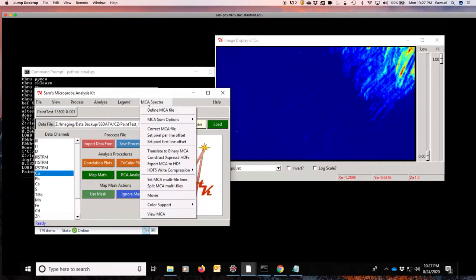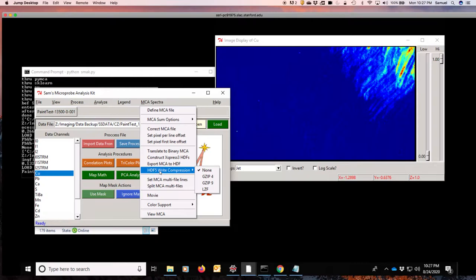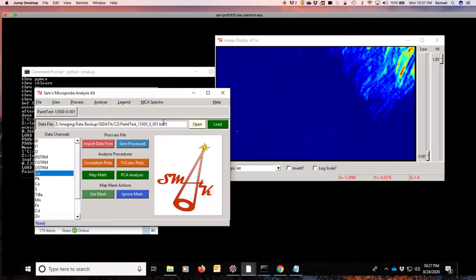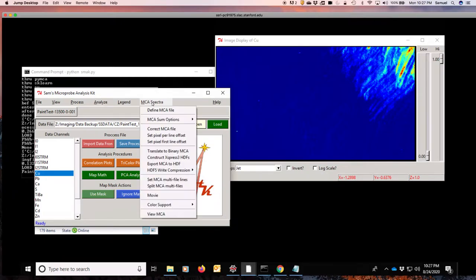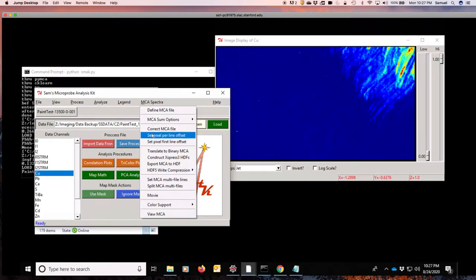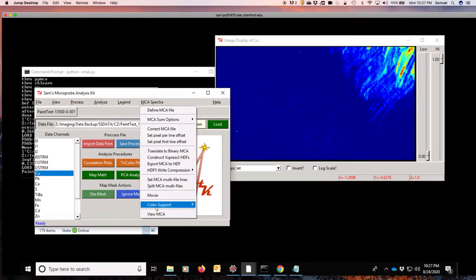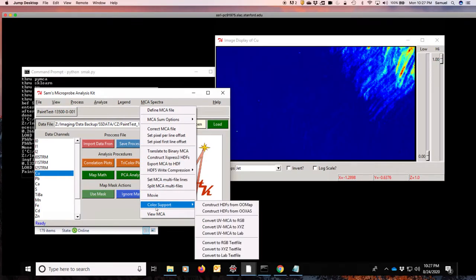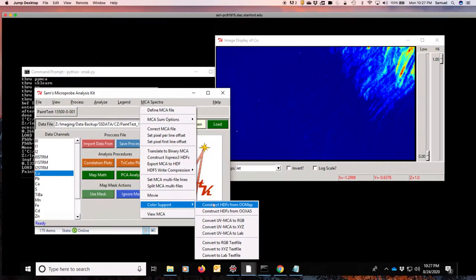I'm going to come here and use a higher degree of compression so we save some disk space. I'll use the GZIP9 for doing this. And just like before when we would construct an Xspress3 HDF, we will now go down to the color support menu and we will construct an HDF from the Ocean Optics maps.